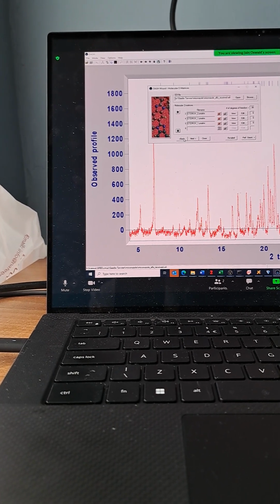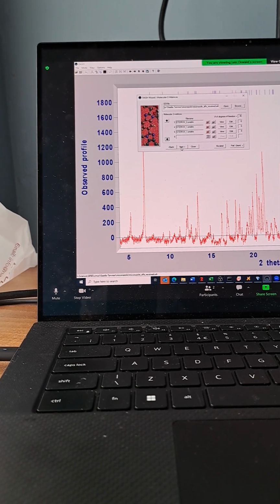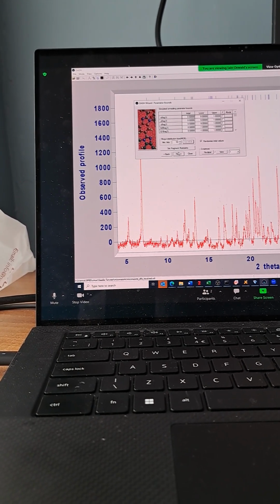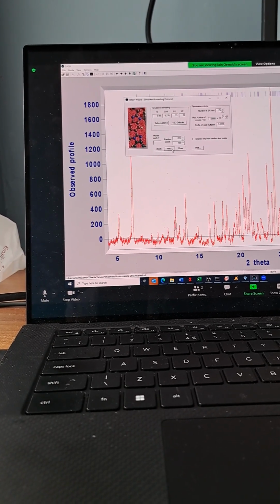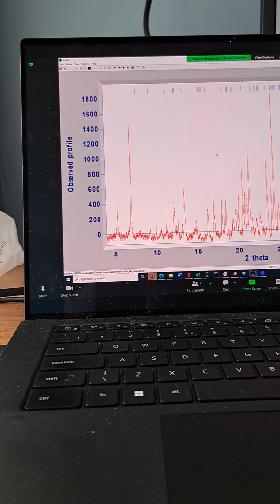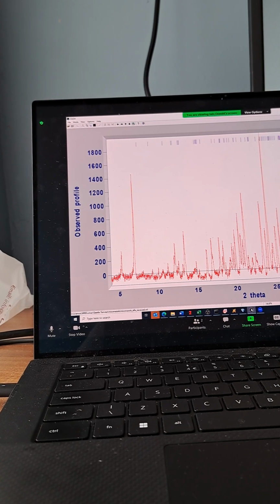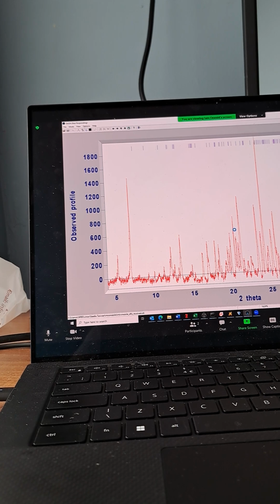What you want to do is ensure that you've got the right number of molecules in there. So if you think it's a chloride, you put in your chloride plus 2 waters, 3 waters. And then you can click on next. A lot of this is just clicking next, and solve. What it'll do is go off and try to solve the crystal structure for you. It's just going off and starting to do that.